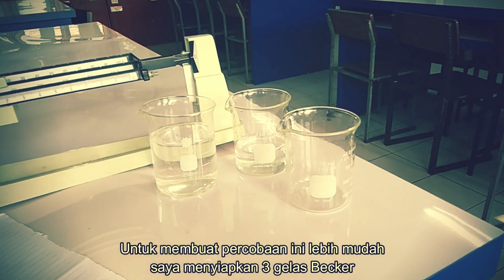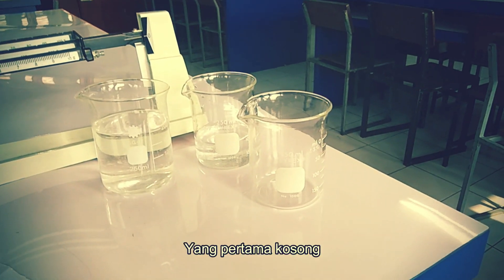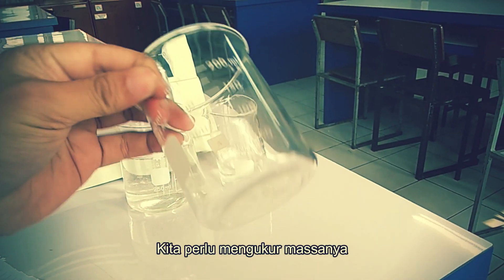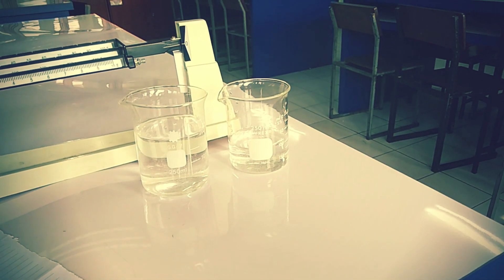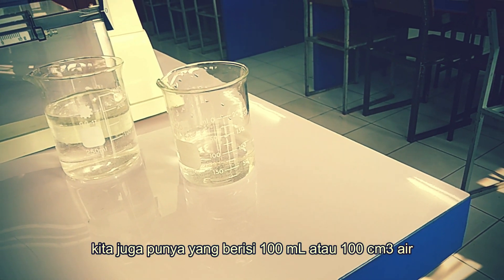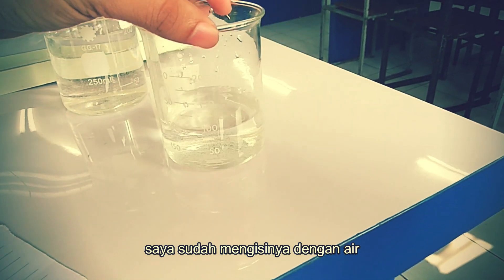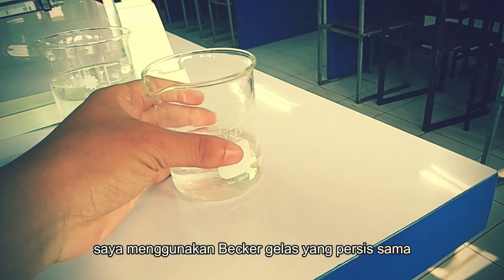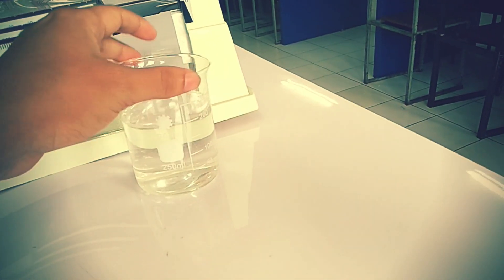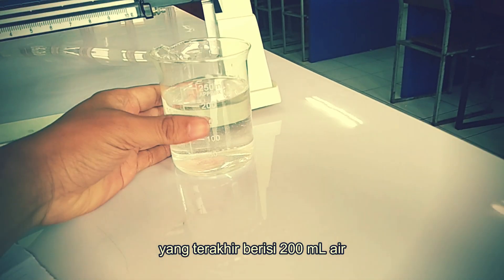To make the experiment easier, I prepared 3 old beaker glasses. The first one is empty. We need to measure the mass, and then we have 100 ml or 100 cm³ filled with water — the exact same beaker glasses — and the last one will be 200 ml of water.